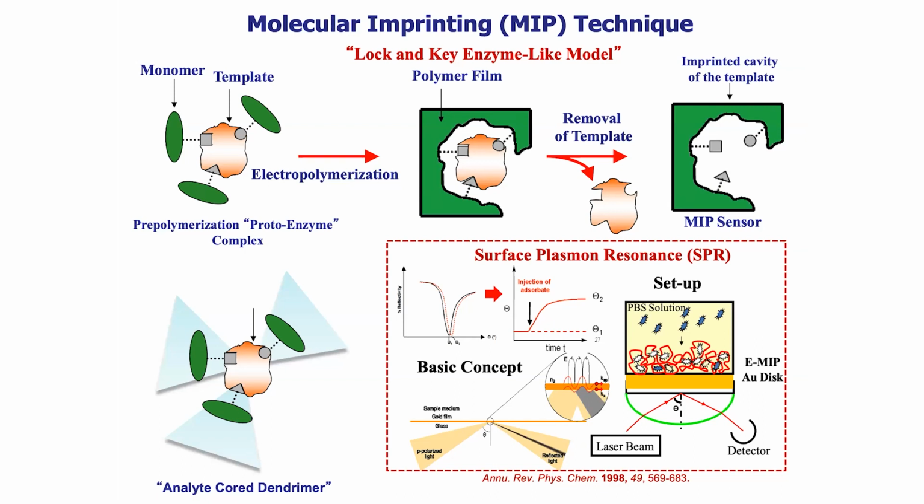Now, utilizing substrates such as gold, which is used for surface plasmon resonance spectroscopy methods, can subsequently be demonstrated as a sensitive element for the buildup of sensor devices. So an SPR sensor will allow us to observe this binding assay on these artificial enzymes that are bound on substrates.